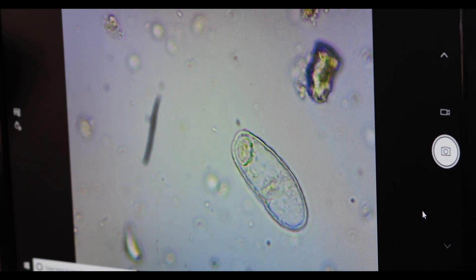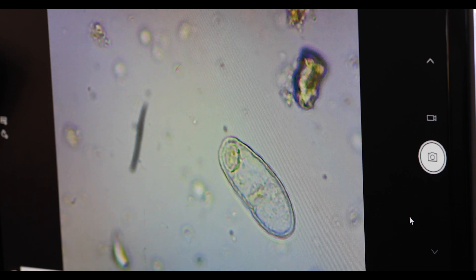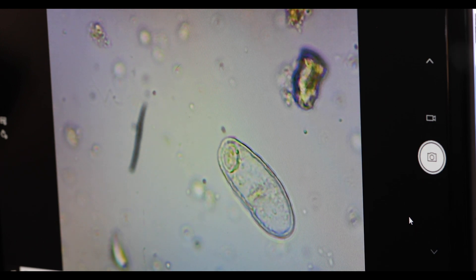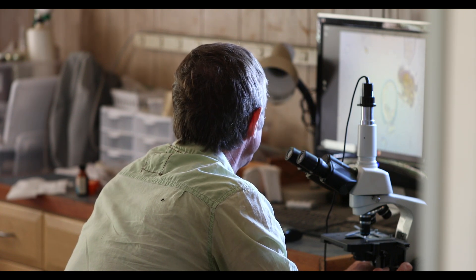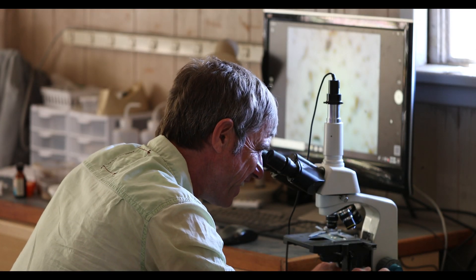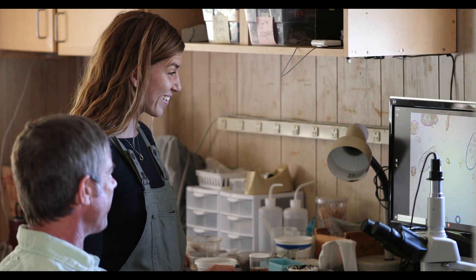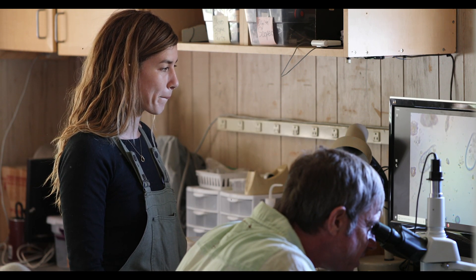This is under 400x now — pretty high power. Everything you see on the screen, the smallest things, are bacteria — one micron across, 10 to the minus 6 of a meter. So it gives you an idea of the size of this testate amoeba, which might be 20 microns across. Certainly a representative member of the soil food web that we want to see in our sample. Lots of testate amoeba. This is just from one drop of a diluted sample — 1 to 10 dilution. Ton of testate amoeba in there, more than we usually see — definitely more than we usually see in one drop.